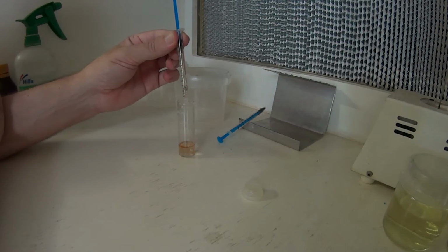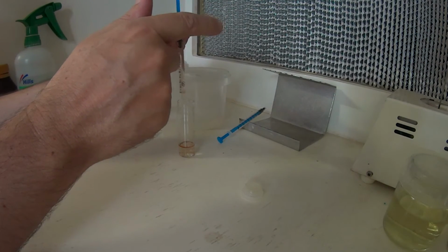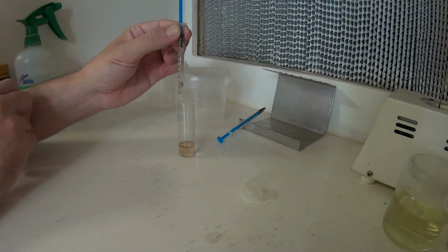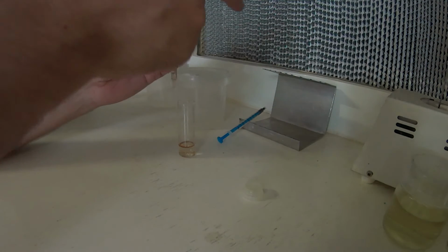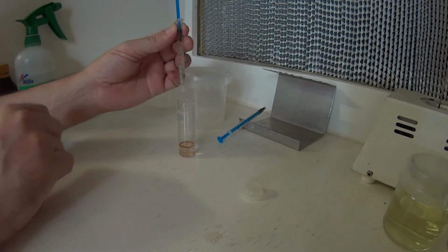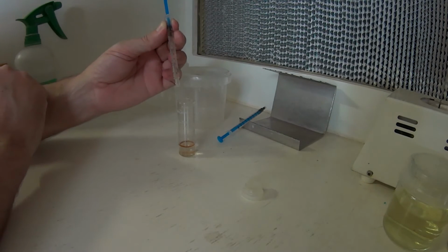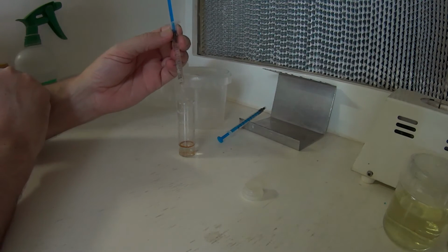Give it a few seconds to float to the surface. Get the odd tap. Like I said, because we're just injecting hydrogen peroxide into these containers, once they're exposed to a fair bit of light, hydrogen peroxide will break down to water and oxygen, and no residue will be left behind.